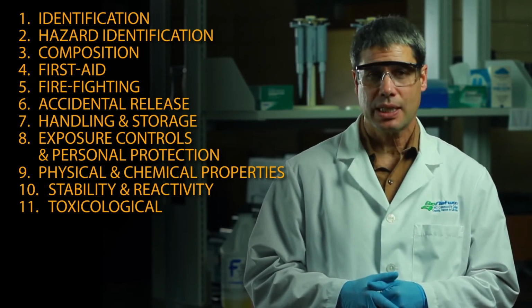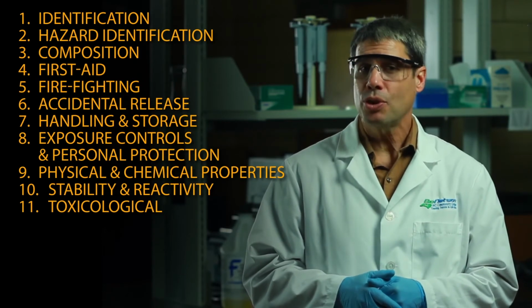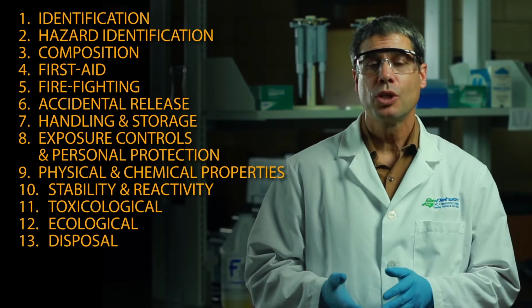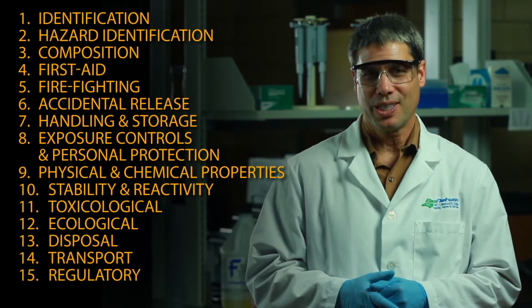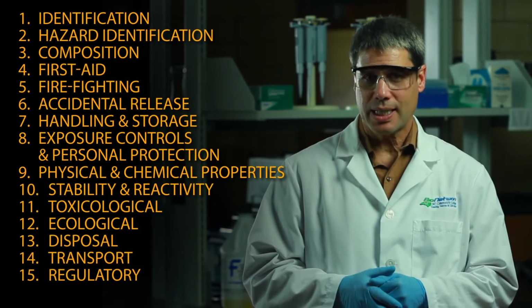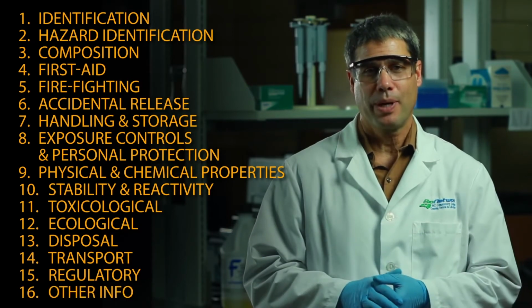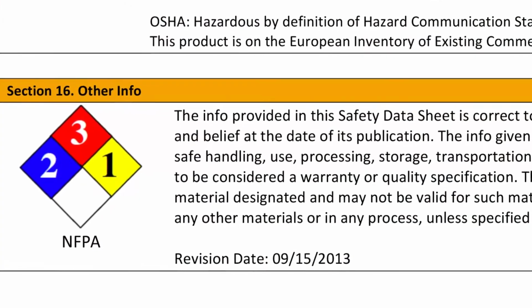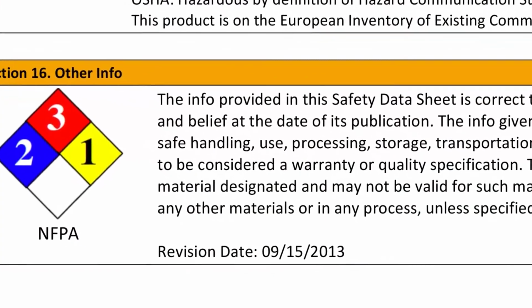Sections 12 through 16 aren't mandatory, but you should at least be familiar with them. Ecological, disposal, transport, and regulatory considerations. Section 16 is for any other pertinent information. This is where you'll find the date that the SDS was prepared along with the last known revision.